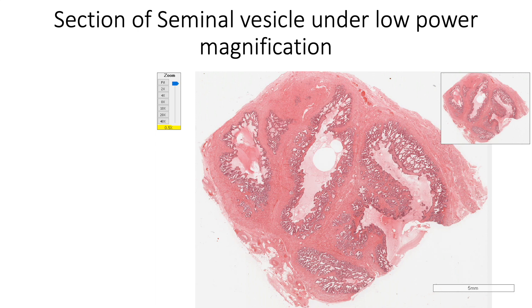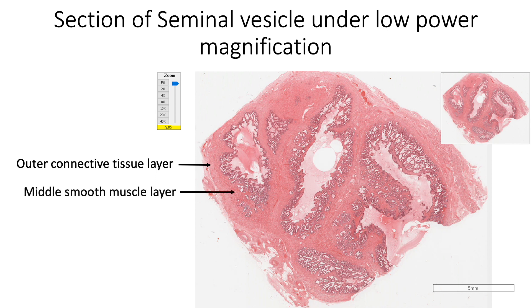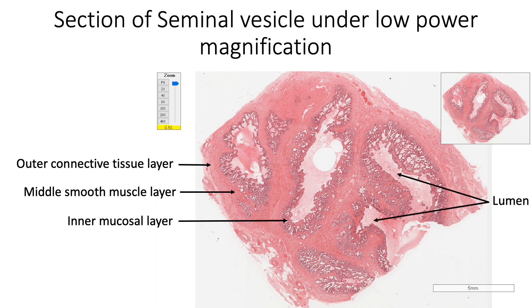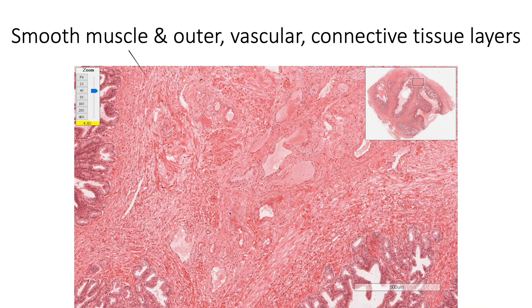Seminal vesicles are highly coiled tubular glands containing an outer connective tissue layer, a middle smooth muscle layer, and an inner mucosal layer around the lumen. Smooth muscle fibers are arranged as a circular layer, and the outer connective tissue has blood vessels in it.